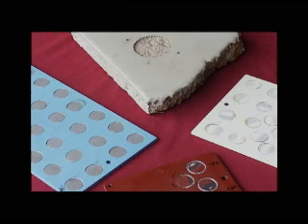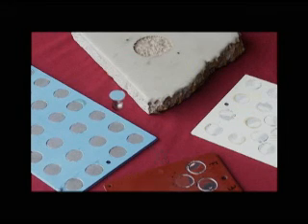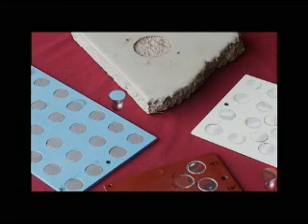Following a pull-off test, the breaking points, demonstrated by fractured surfaces, occur along the weakest plane within the dolly adhesive coating substrate system.